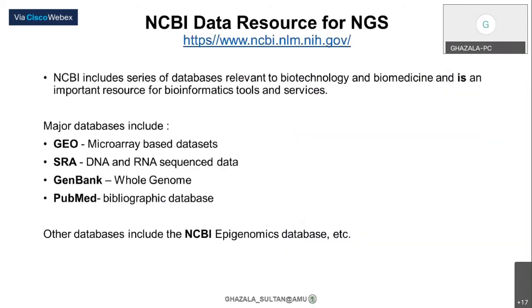Next are the databases, the repositories where we can get the data, whether it is sequence data or whole genome sequence, whatever information we want to get. We all know NCBI is one of the major data repositories for bioinformatics as well. From NCBI, there are different databases within, and there are GEO databases from where we can get microarray data.